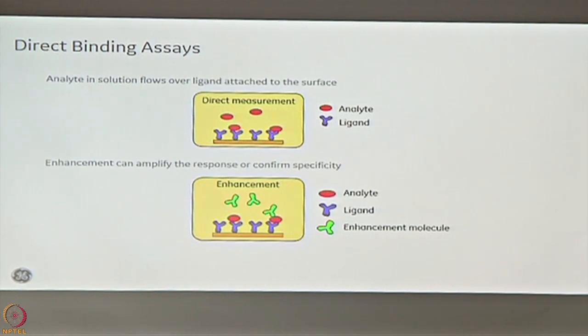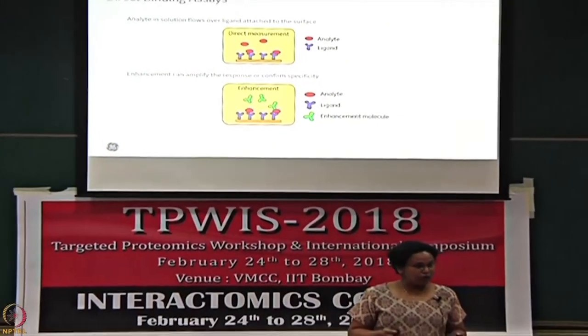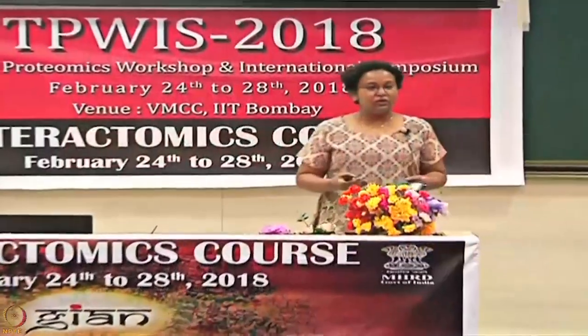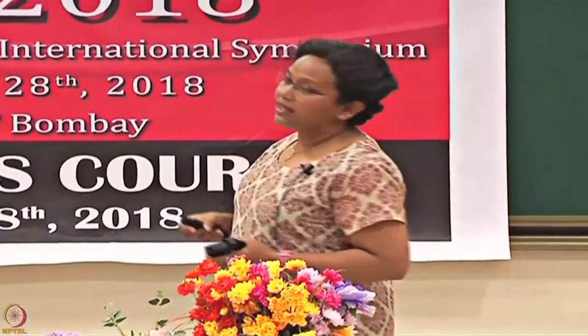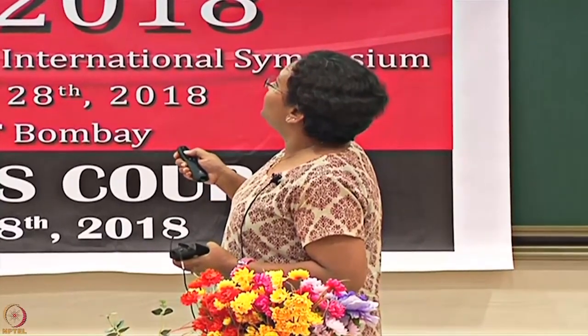You also have another direct format. We call it an enhancement, or it is also similar to the capture method, right, what we were talking about. First the capturing molecule is immobilized, then you bind your ligand, and then your actual analyte comes and binds. You can also call this an enhancement molecule sometimes if you're treating this as a direct binding. If this molecule is extremely small, then you can use an enhancer, a specific molecule that it binds to.